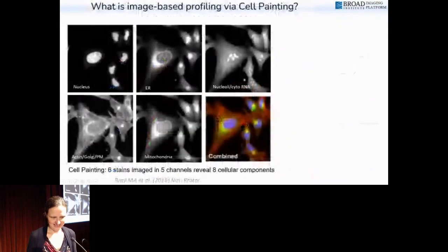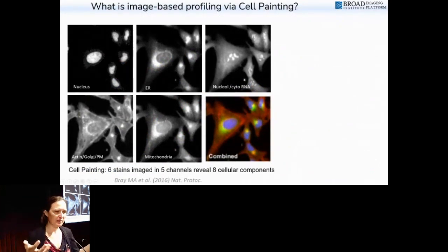All right. Okay, so you might ask, if we are not looking for a particular phenotype, if you're in the world of image-based screening and you want to measure phospho-S6 levels, or you want to count mitochondrial blobs or something, you know what to stain for. In this case, in image-based profiling, we kind of want to measure all the things that the cell is doing morphologically, but what do we stain for if we're just wanting to measure a kind of generic everything of the cell?